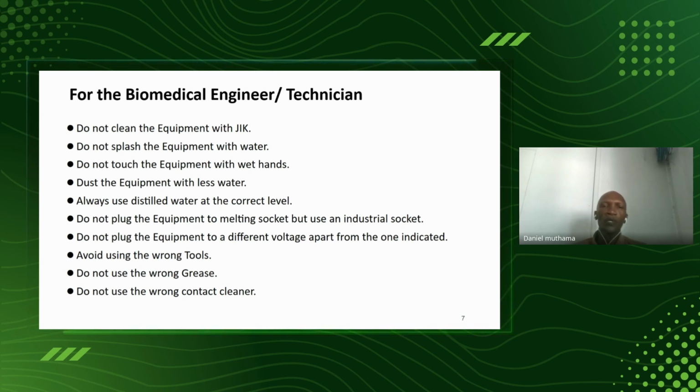Do not plug the equipment into a different voltage apart from the one indicated. This is very important for the engineer. Avoid using the wrong tools. Here, some of our engineers are using pliers to open the screws. This is not allowed. Do not use the wrong grease.